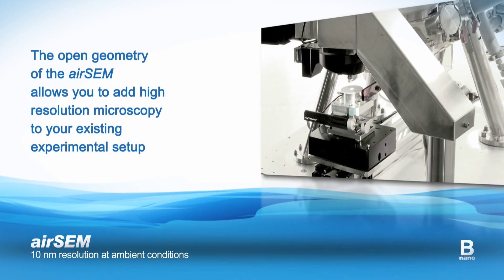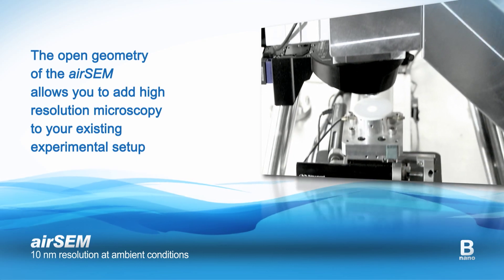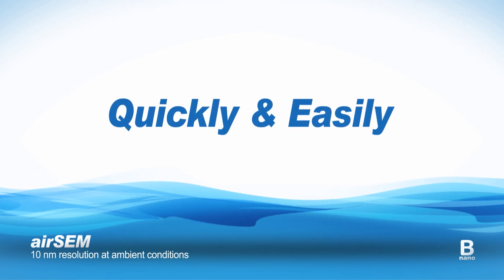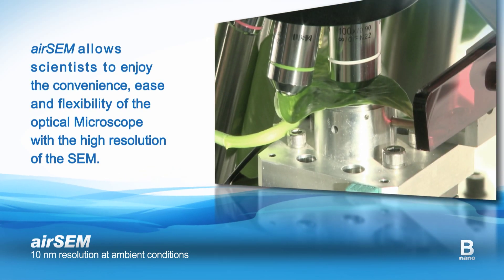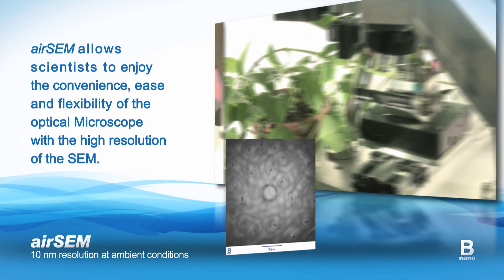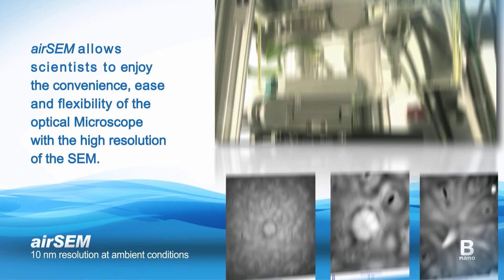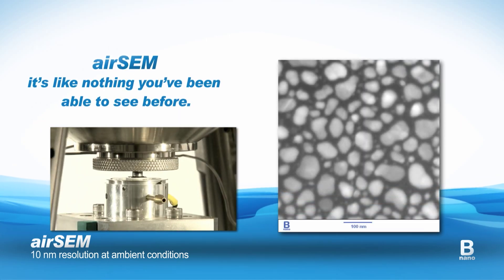The open geometry of the airSEM allows you to add high-resolution microscopy to your existing experimental setup quickly and easily. The airSEM allows scientists to enjoy the convenience, ease and flexibility of the optical microscope with the high resolution of the SEM. The airSEM — it's like nothing you've been able to see before.